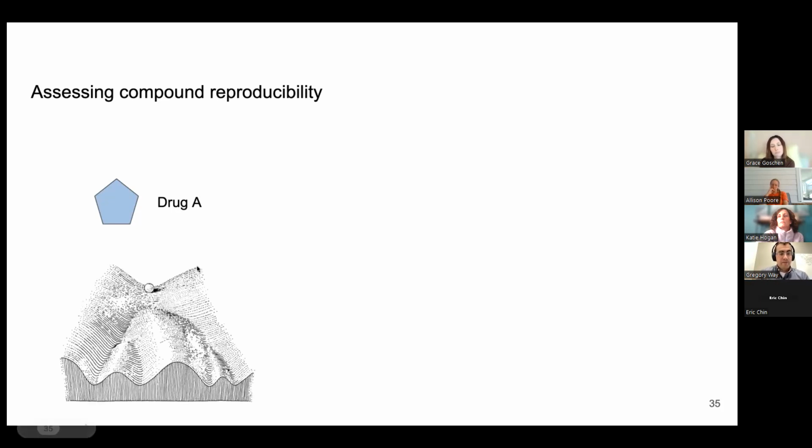And so this might be meaningless, but essentially you can think of the measurement as this high dimensional space that exists in this landscape, this epigenetic landscape, an idea that was basically the founding of systems biology by Conrad Waddington in 1957.